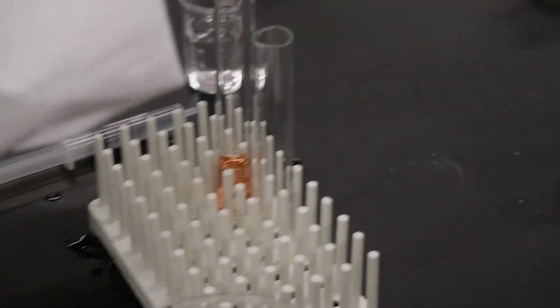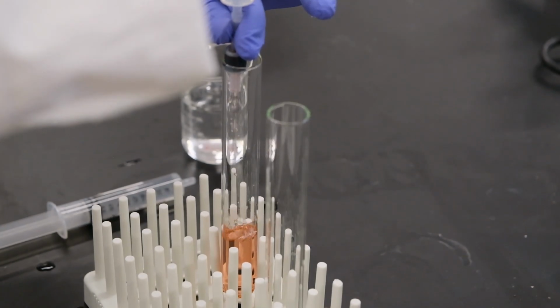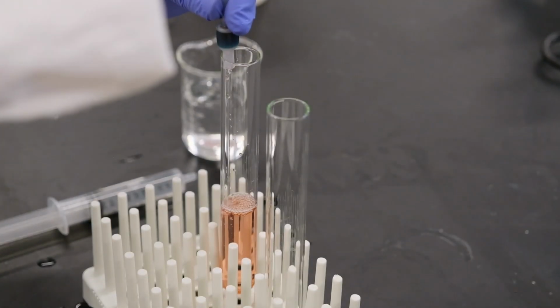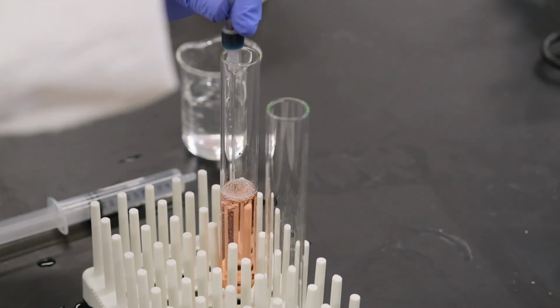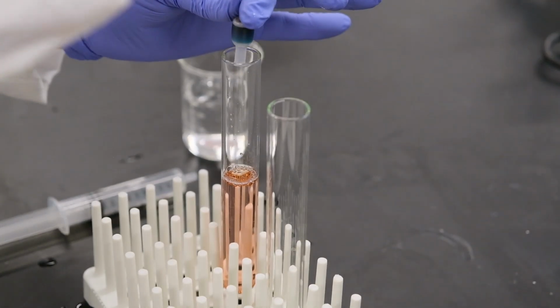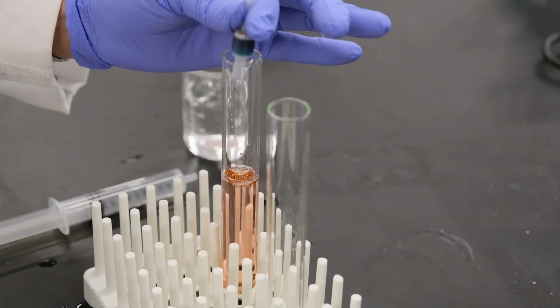So in total, 10 milliliters. We have to keep in account all the solution that we are pushing through our cartridge. This is going to be our solution 1 that should contain only the Allura red.